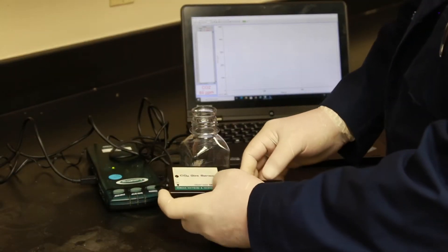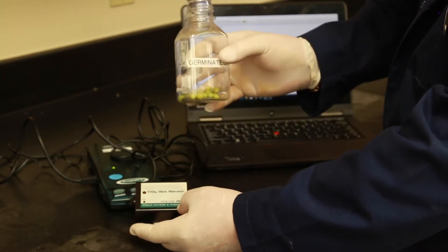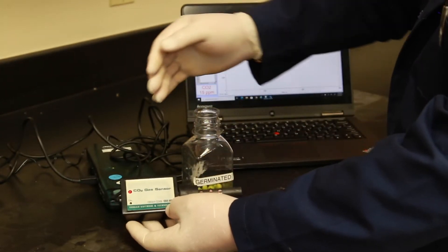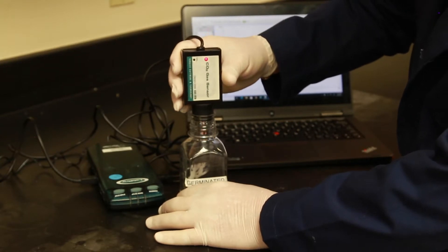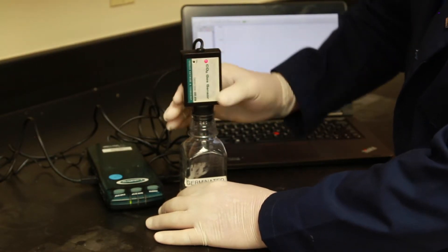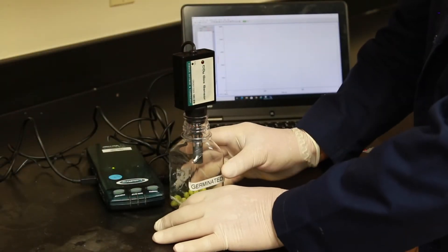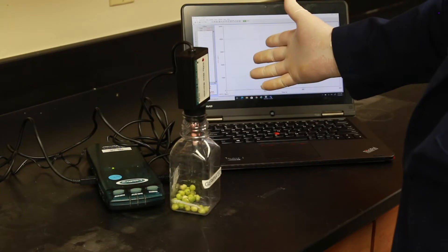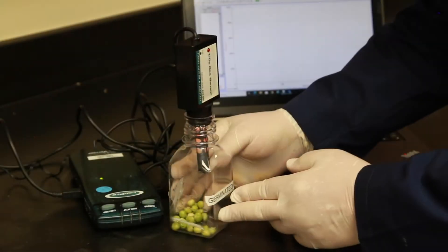Here we have the Vernier LabPro CO2 sensor. This is going to be inserted into the mouth of the plastic flask. Once this has been inserted into the mouth of the plastic flask we then have to allow the flask to equilibrate and we will allow the CO2 sensor to sit for one to two minutes. While the CO2 sensor is equilibrating to the software on our laptop computer we will begin taking measurements.